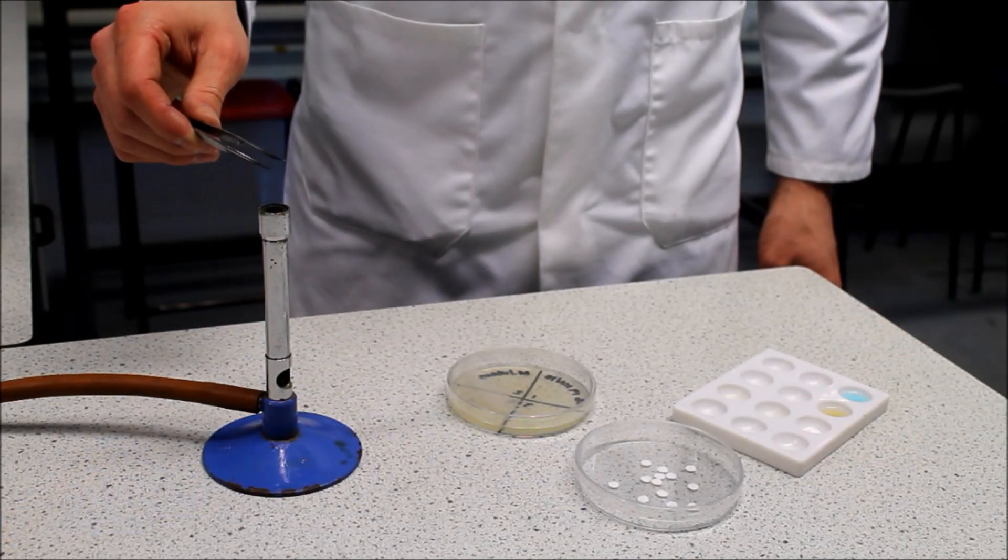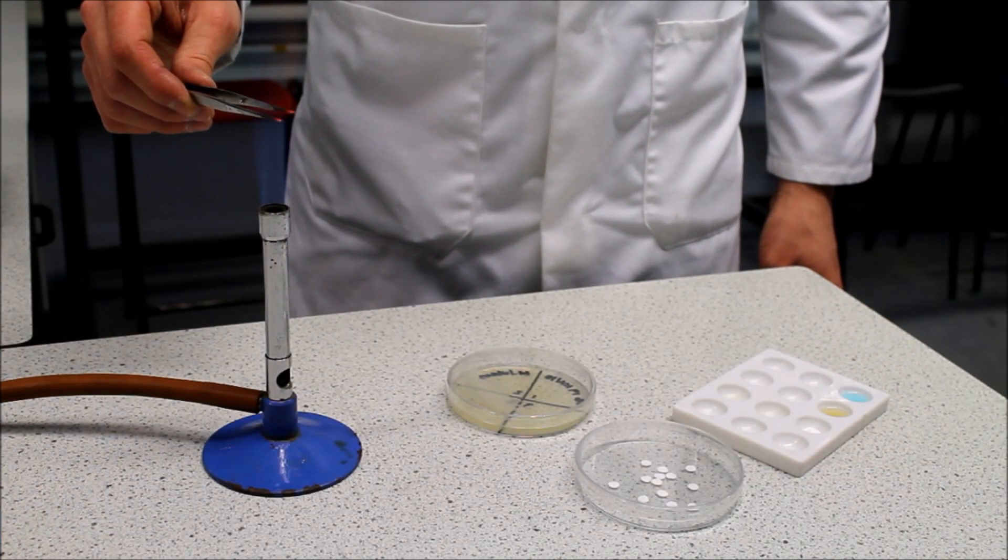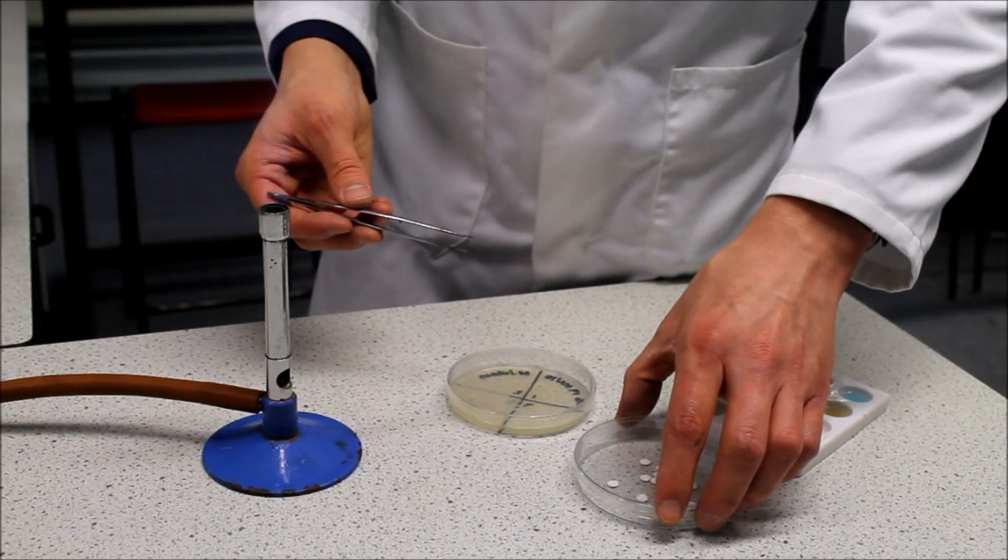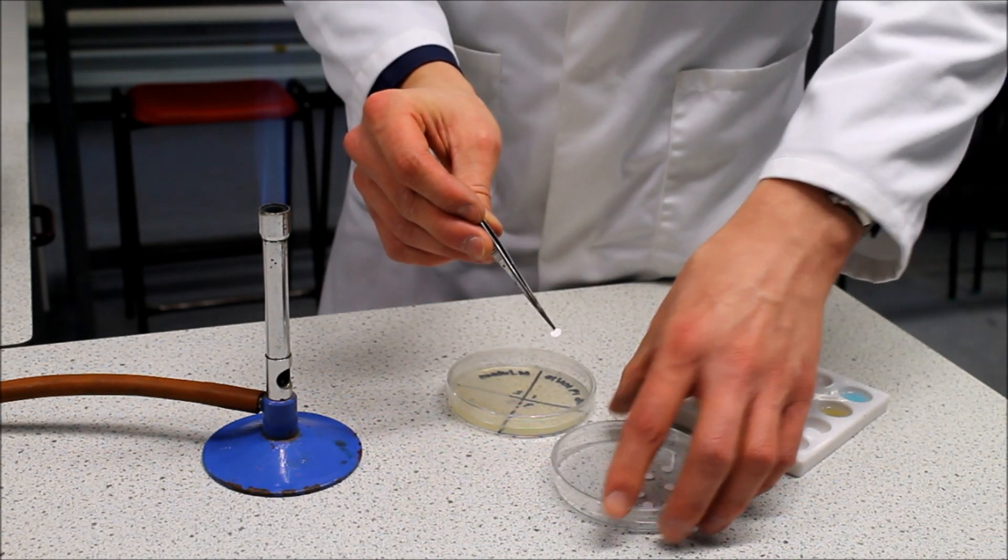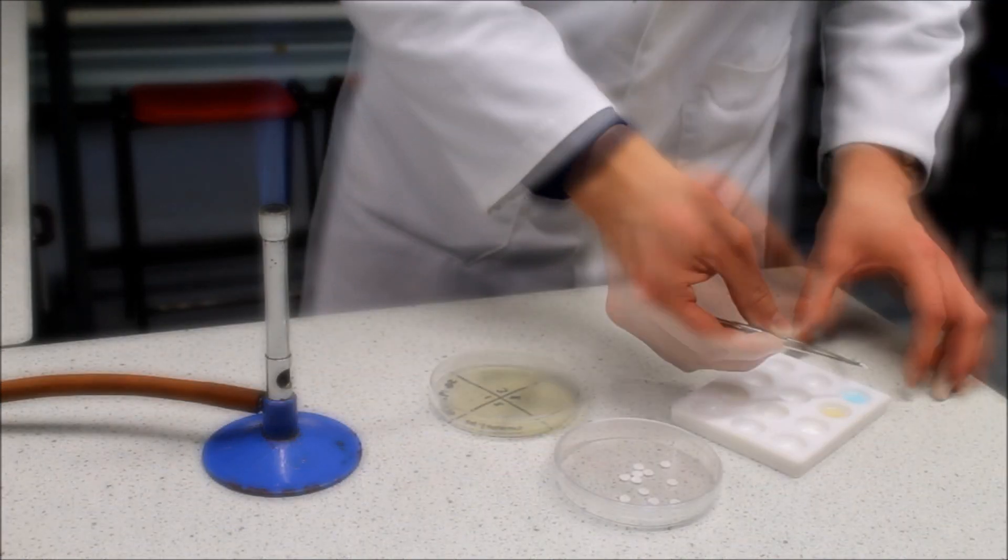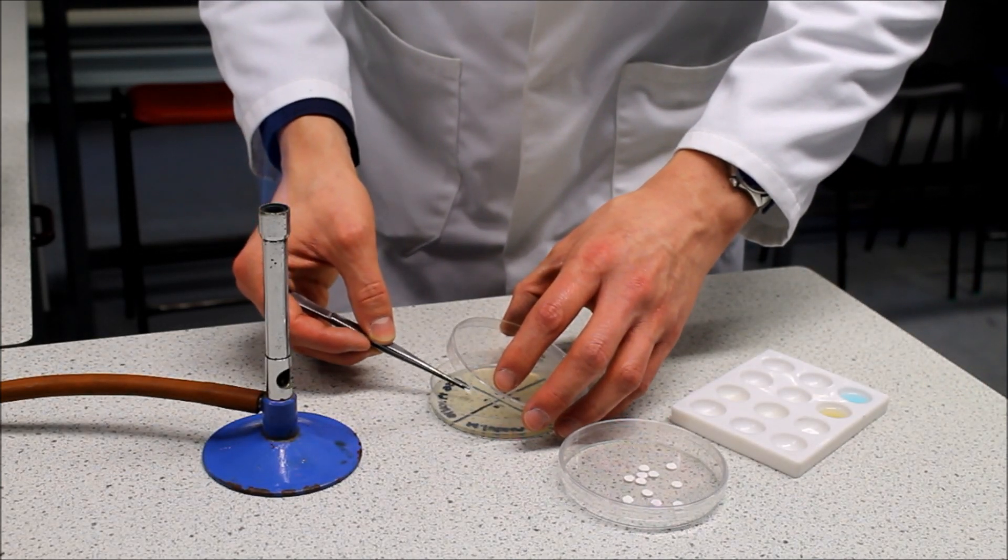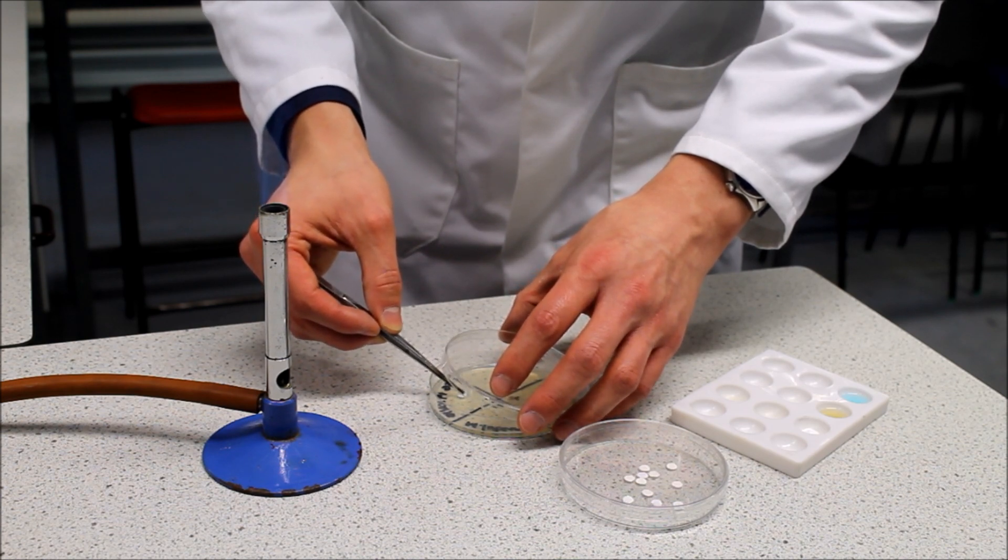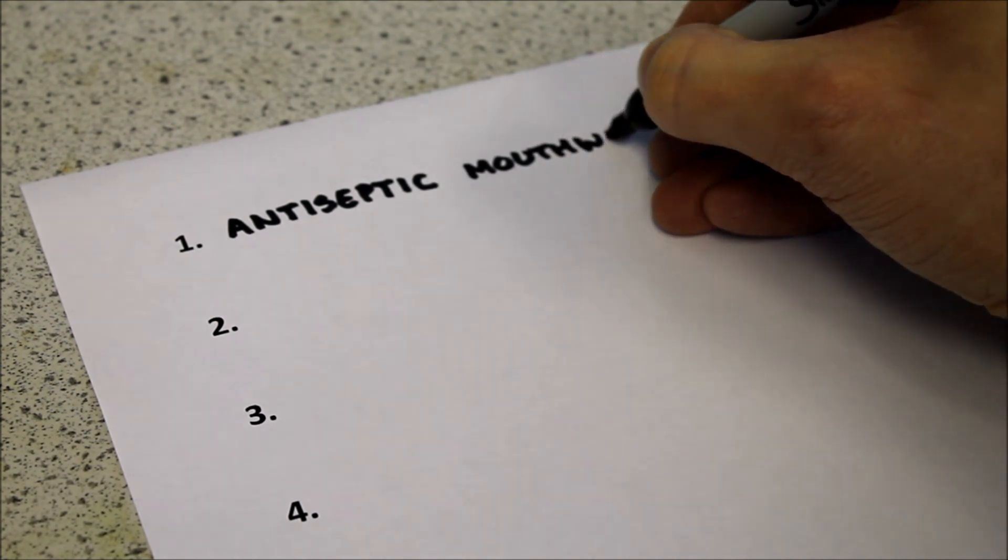Sterilize the tips of the forceps by holding them in a blue Bunsen flame until they glow orange. Once the forceps have cooled use them to pick up a paper disc and dip it into the first of the antiseptics. Again slightly lift the lid of the agar plate at the side nearest the Bunsen burner. Place the disc at the center of section one and replace the lid. Don't forget to make a note of which antiseptic is in section one.